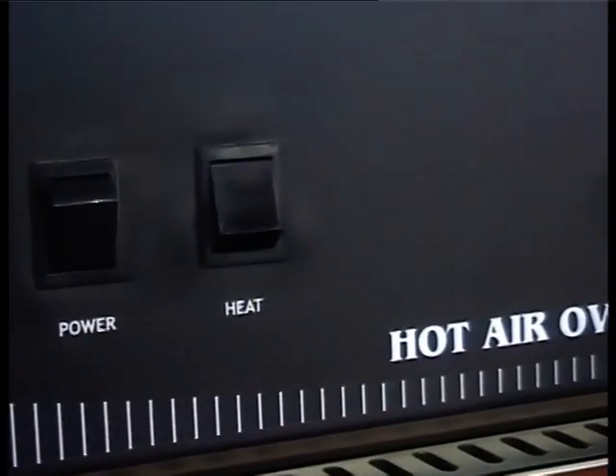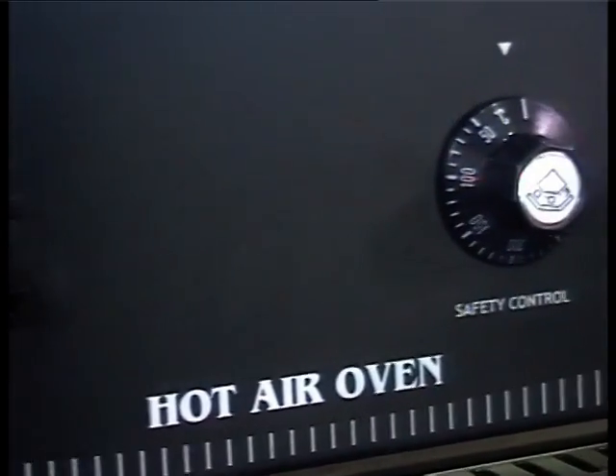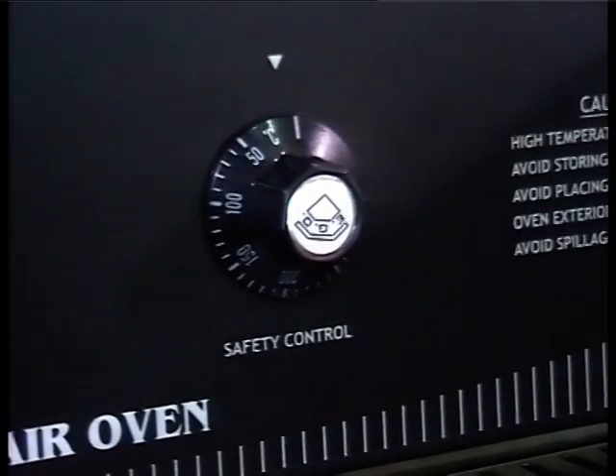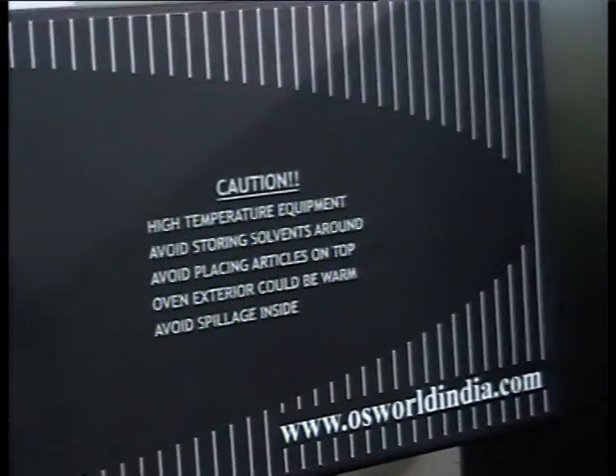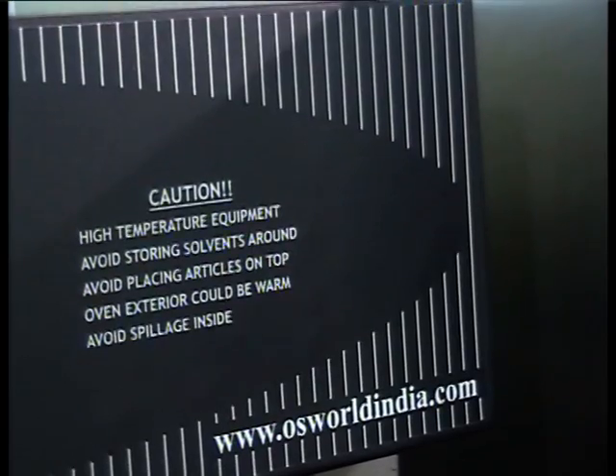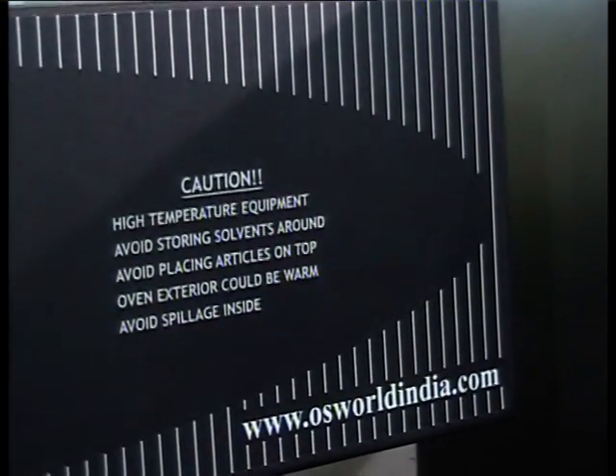The oven has a temperature range of approximately 5 to 250 degrees Celsius. It has a temperature control accuracy of ±2% of the set point and a temperature uniformity of around ±5% of the set value. It is controlled with the aid of a CE marked microprocessor-based PID control with auto-tune, which makes it easy to achieve and maintain the exact temperature desired.